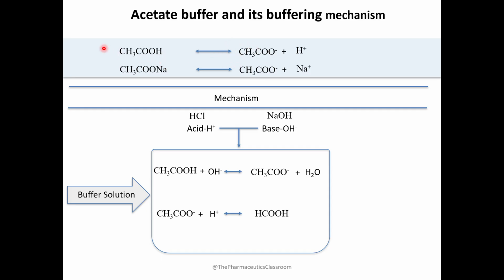If I'm taking 10 molecules of acetic acid, 5 will dissociate and 5 will remain, so they maintain an equilibrium. When I take sodium acetate, it will dissolve and form the acetate ion and sodium ion.